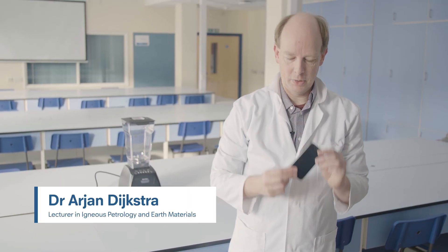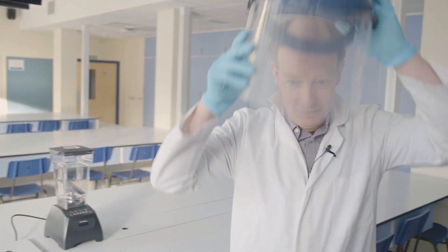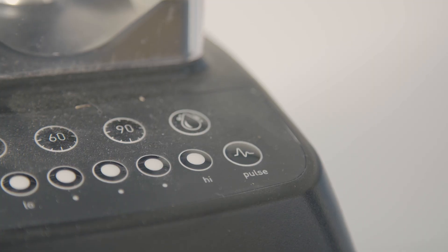If we want to analyze this phone and work out what it's made of, we need to grind it to a very fine powder. Put these on, just to be safe — we're ready to go.